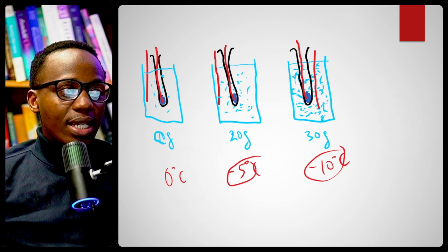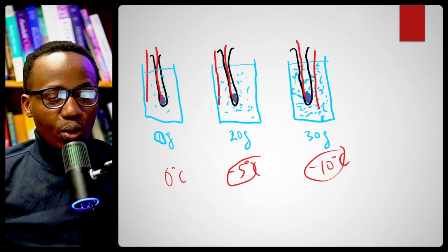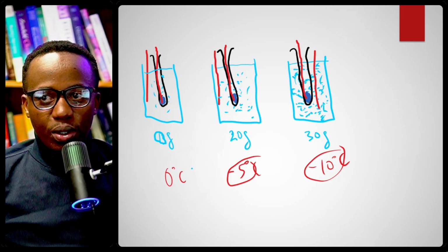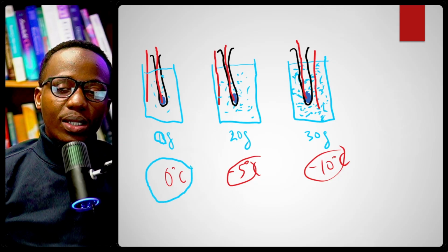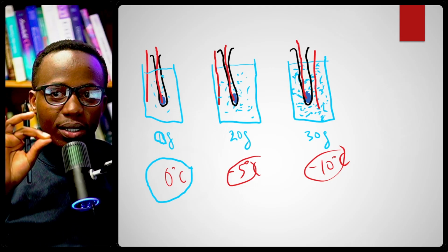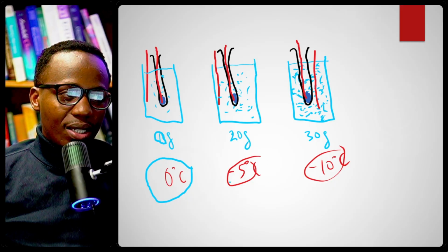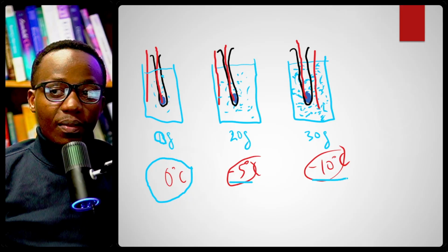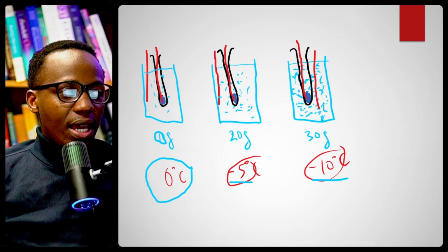So the first one doesn't have any salt, right? But if it doesn't freeze, that's okay. You can use 0 degrees Celsius as the starting point, the freezing point with no salt, so that if it freezes here or here, then you'll be able to find the delta TF.